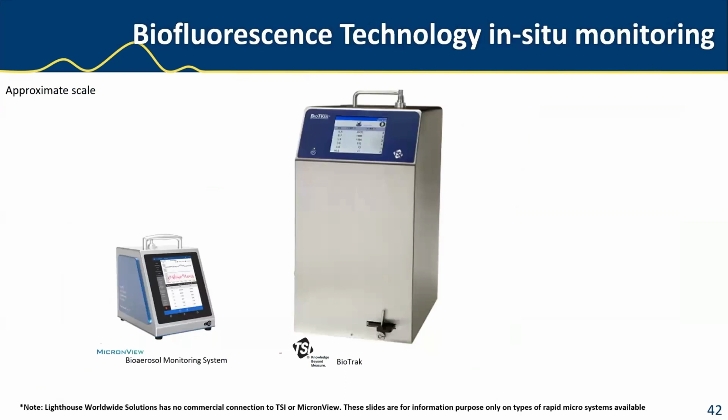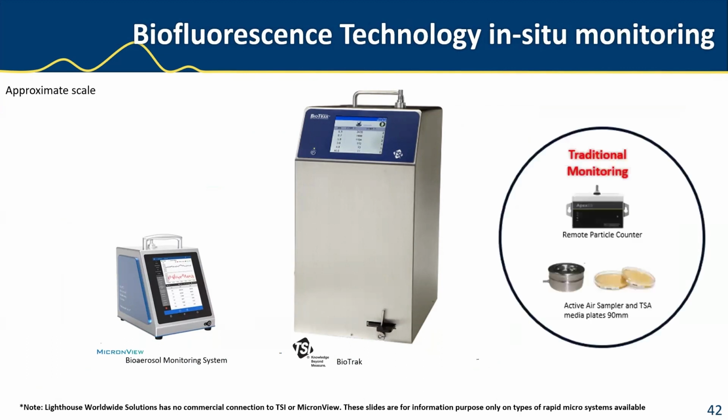Then also the other start is the biofluorescence technology, the in situ monitoring. There are a couple of products out there. MicronView is one, TSI BioTrack is another. Are they going to replace traditional methods? Well, that's the question. Again, you need to look into the technology.